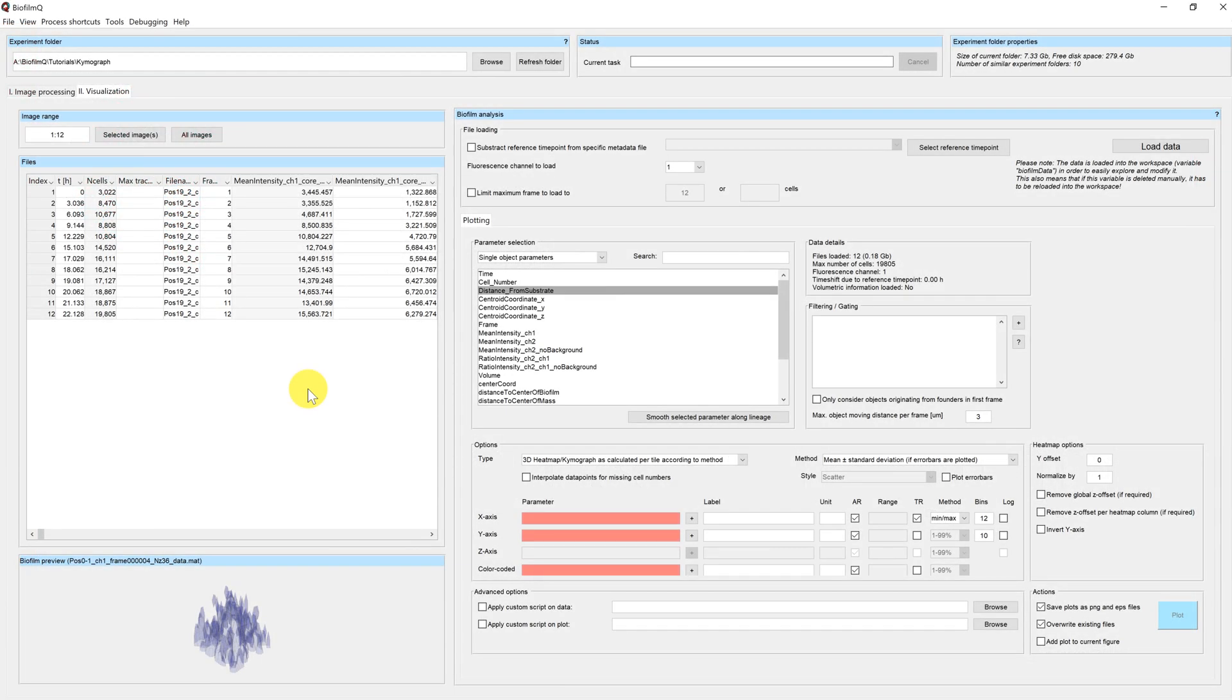Welcome to this Biofilm Q tutorial. My name is Hannah and today we'll have a look at the kymograph and demograph plotting.